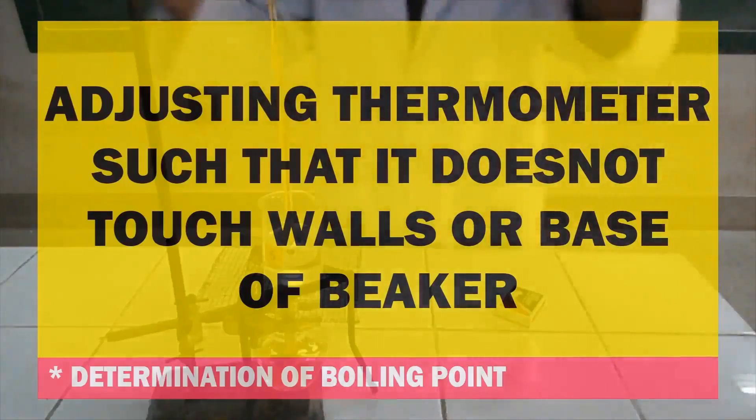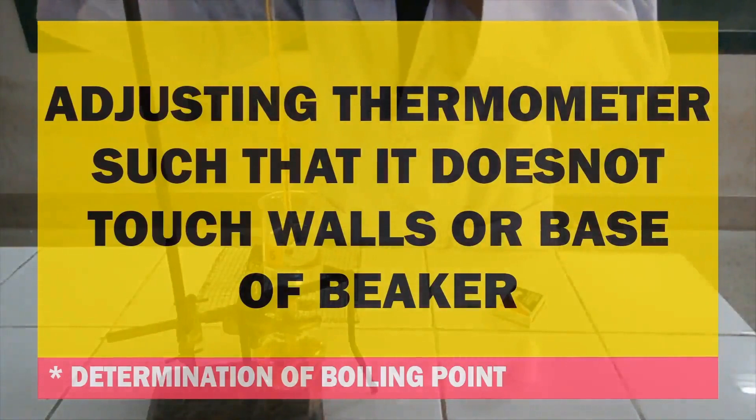Adjusting thermometer in solvent bath such that it doesn't touch walls or base of beaker.